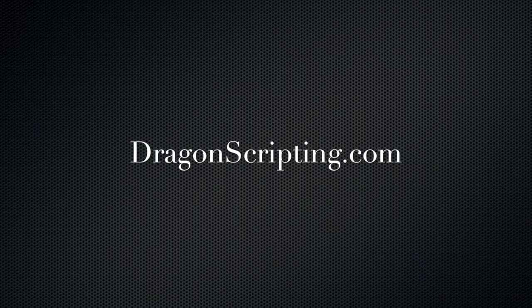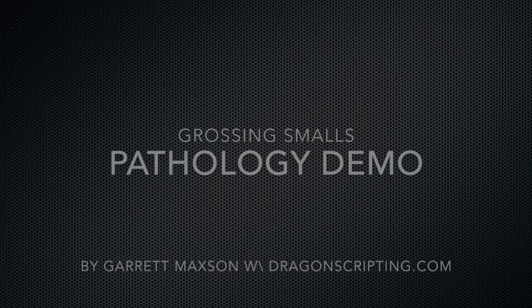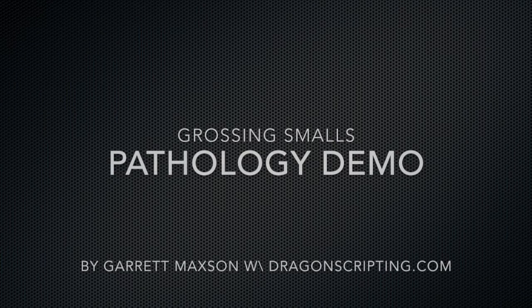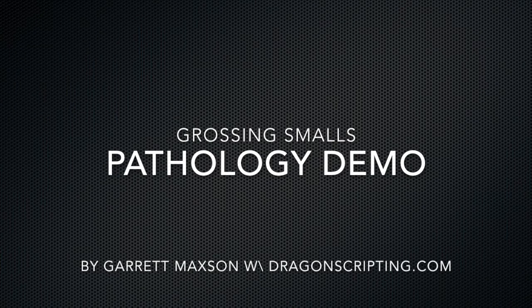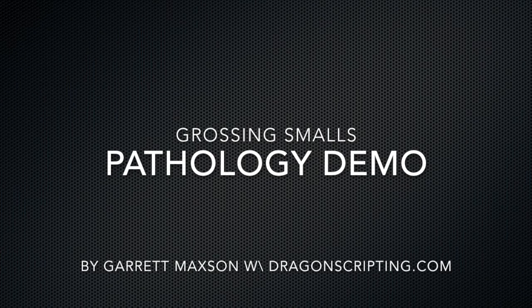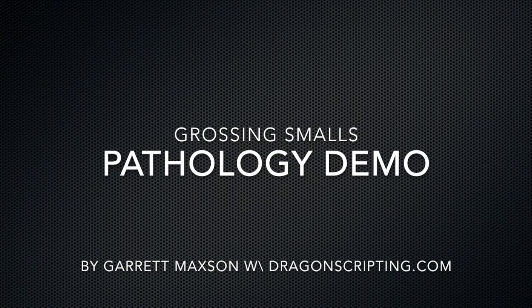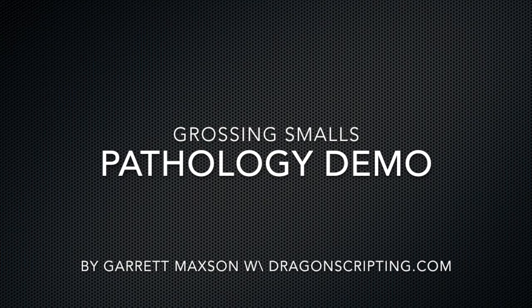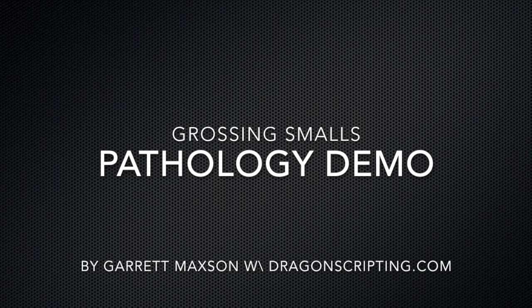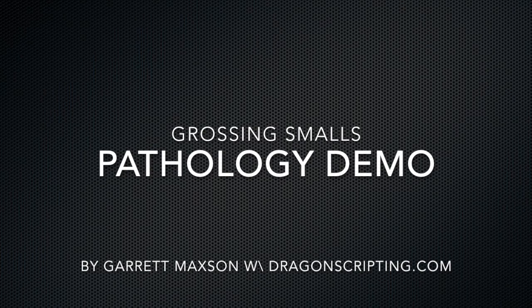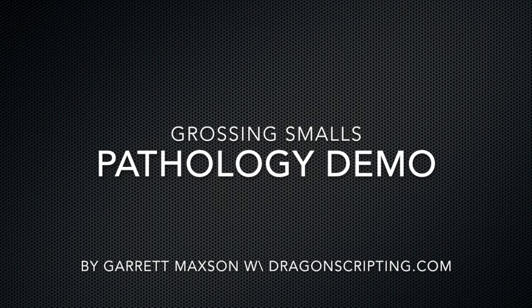Today we're going to be going over a demonstration video on how to use Dragon in the gross room. You're going to see one of our tissue techs grossing in real time on real patients, and then you're going to mostly see on the big screen me using Dragon on another computer, having Dragon run through test patients on Test CoPath.